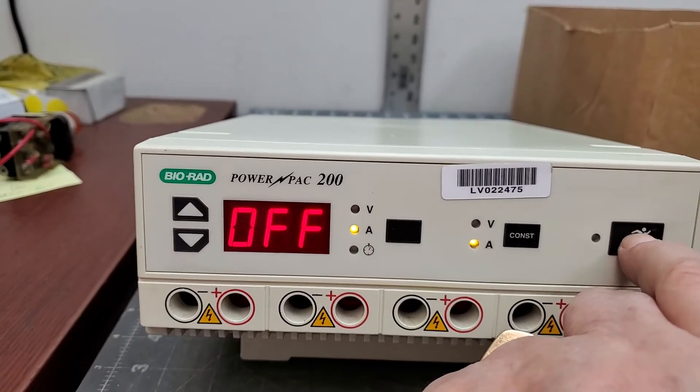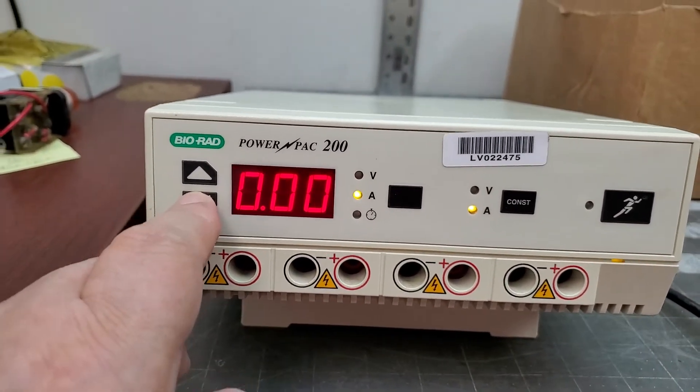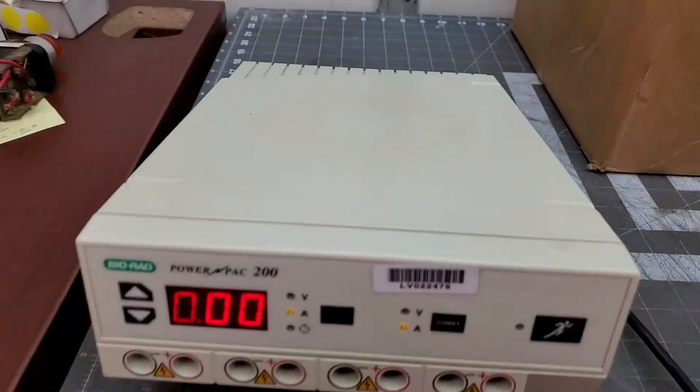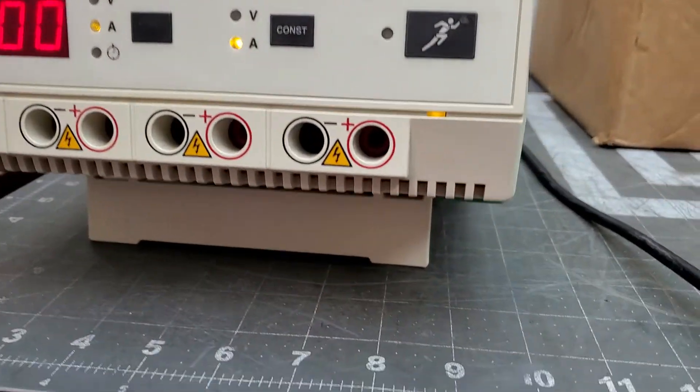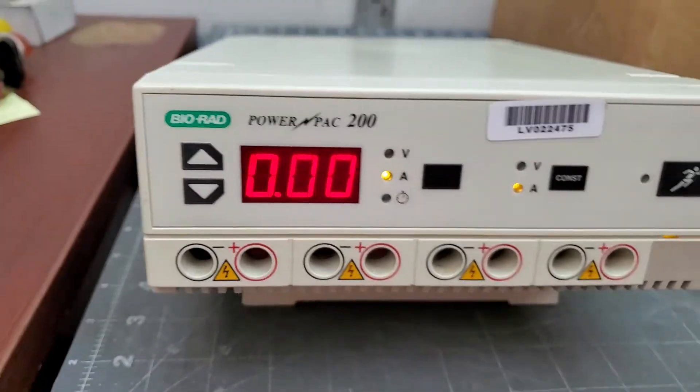Off. I guess I turned it off. Well, this is what it is. I'll take some individual shots. Appears to be functioning. Good luck bidding.